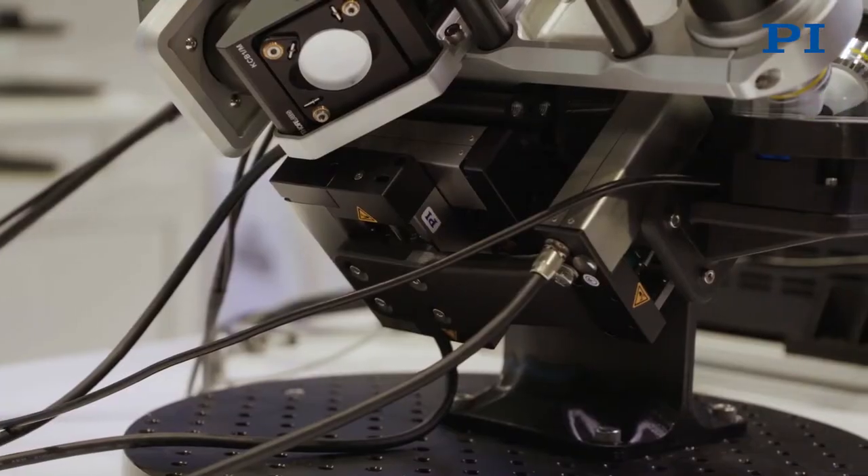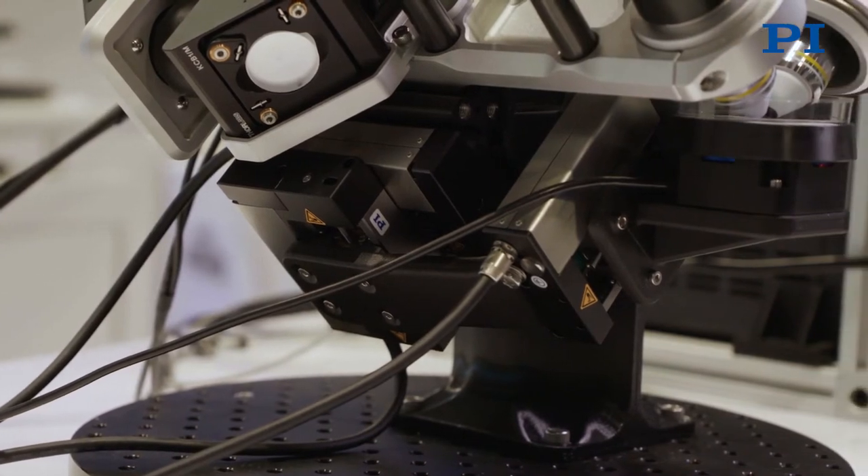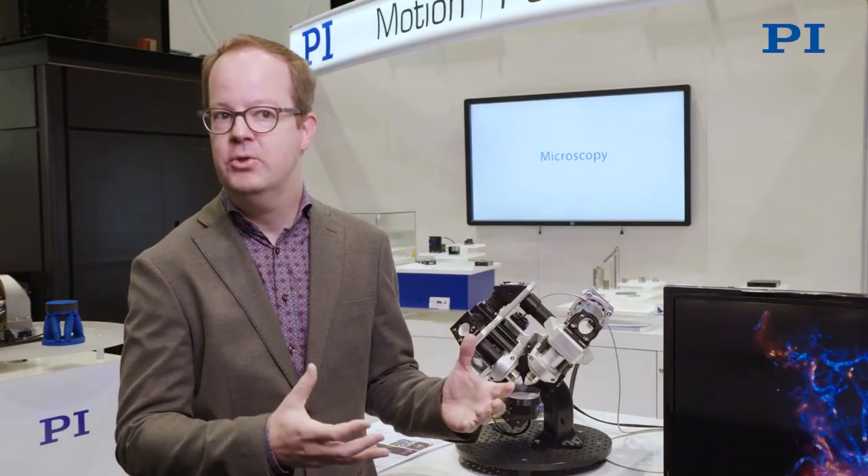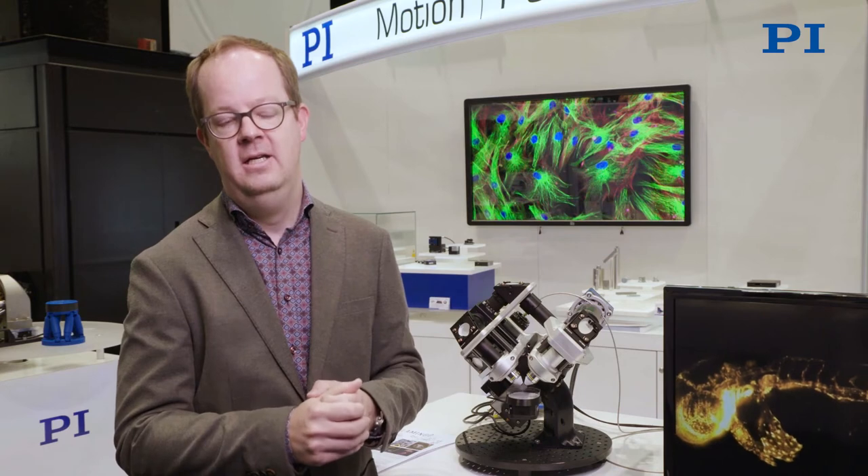For the first time, we have an instrument that is so modular that we can change its configuration very easily. And at the same time, it's portable — so lightweight that we can put it in a suitcase, take it to a workshop, take it to a conference like here, or take it to the scientists to do the experiments in their labs.